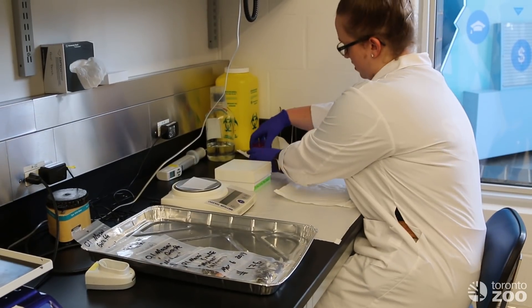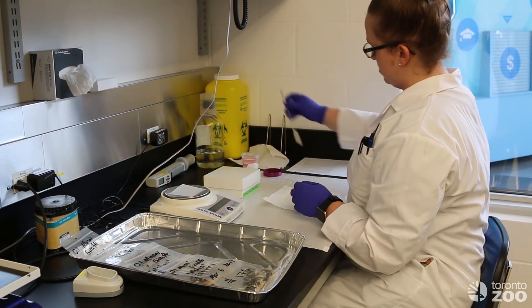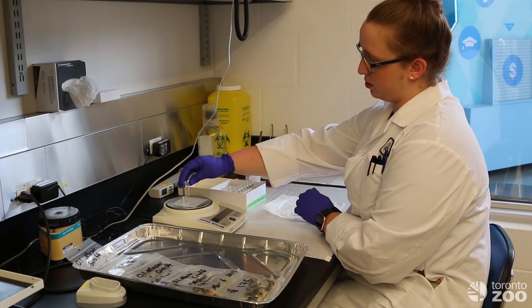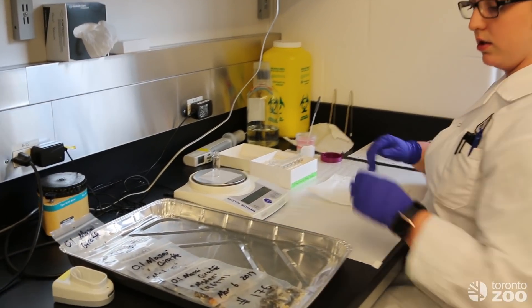Once the samples are thawed we will then start to weigh them out. We have our tubes that are already labeled with the numbers to keep track of where we are in the order.